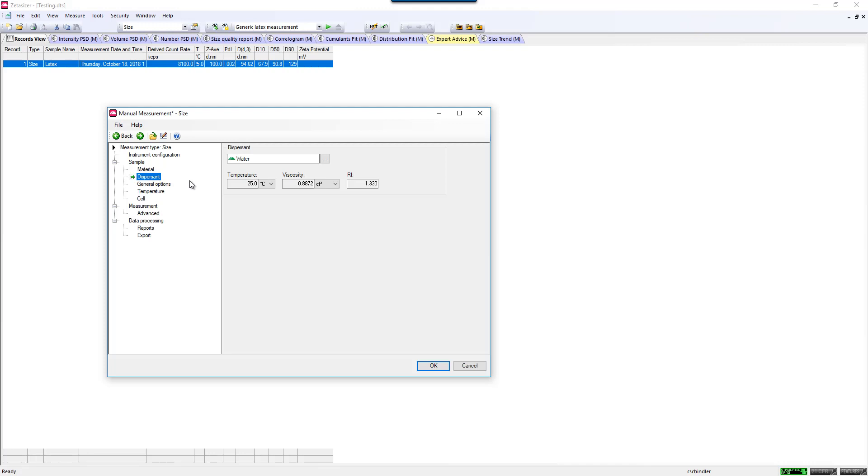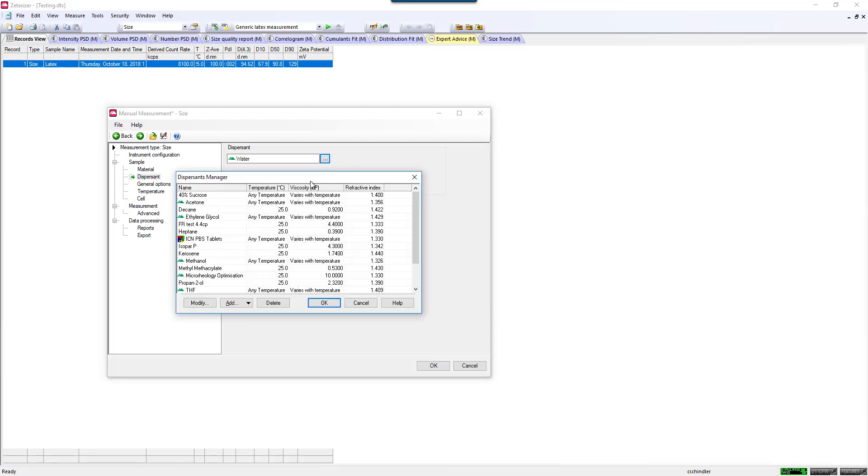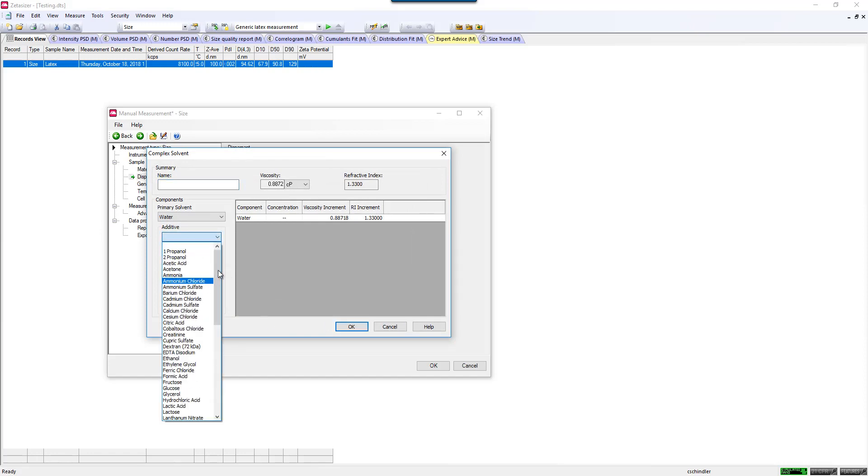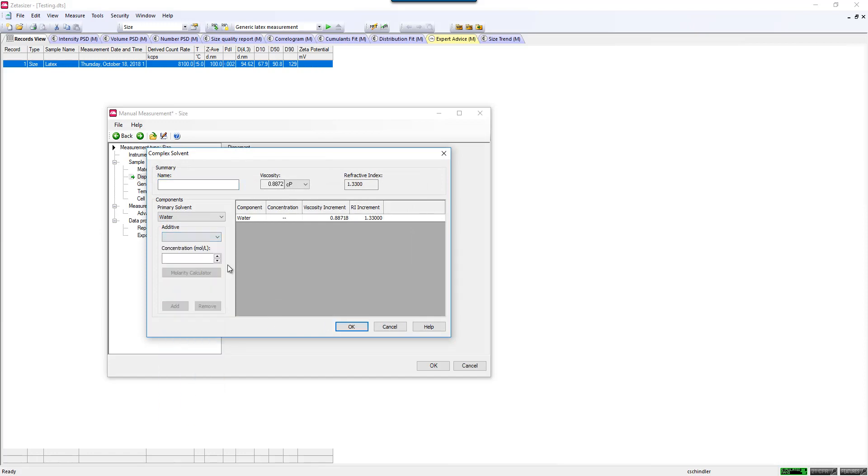The dispersant is the next tab, which is more critical. You need to know the sample's viscosity so that you can calculate the hydrodynamic size. There's a more extensive variety of solvents and buffers that you can pick from in this library. You can also add your own as well. And there's a handy complex solvent builder. If you're working with buffers that are complex, and you would like to build in the specific additives to your buffer at different concentrations.